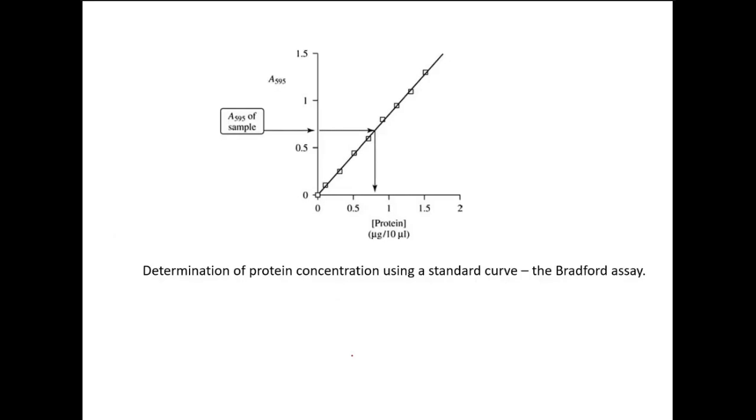Finally, in a given sample, you can easily quantify how much protein is there. As I told you, I have been working with the tomato plant for almost 12 years. So we used to quantify even for our MSc project, student MSc practicals, the amount of protein present in the sample of interest, especially leaf samples. Before you quantify the protein content of the tomato leaf, we need to construct what is known as a standard graph by using an animal protein as a standard, bovine serum albumin.